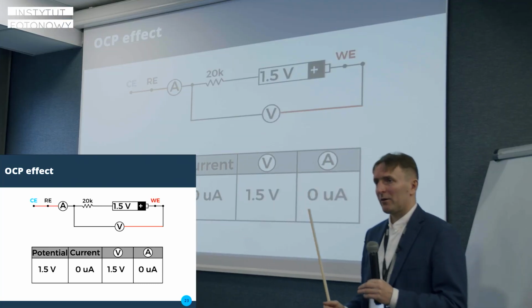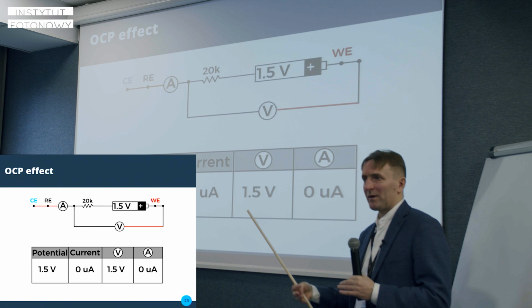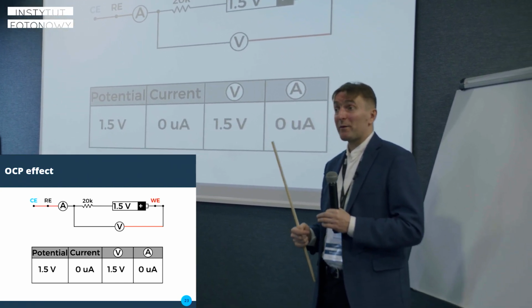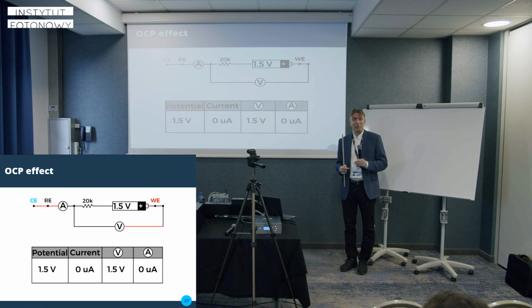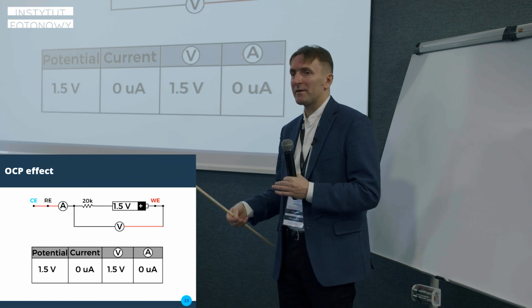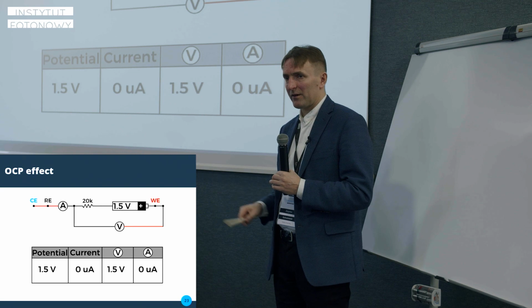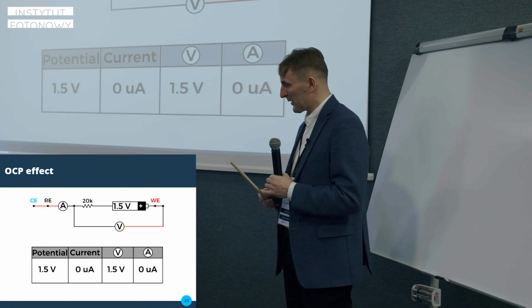So if we have this OCP, then we can start out with our sample with small currents. And for nonlinear samples that are history remembering, it might be a good point to start. You don't want to subject them to large currents or to spikes or anything, because they will remember it, and this will show in your results. So OCP is a good thing to start.